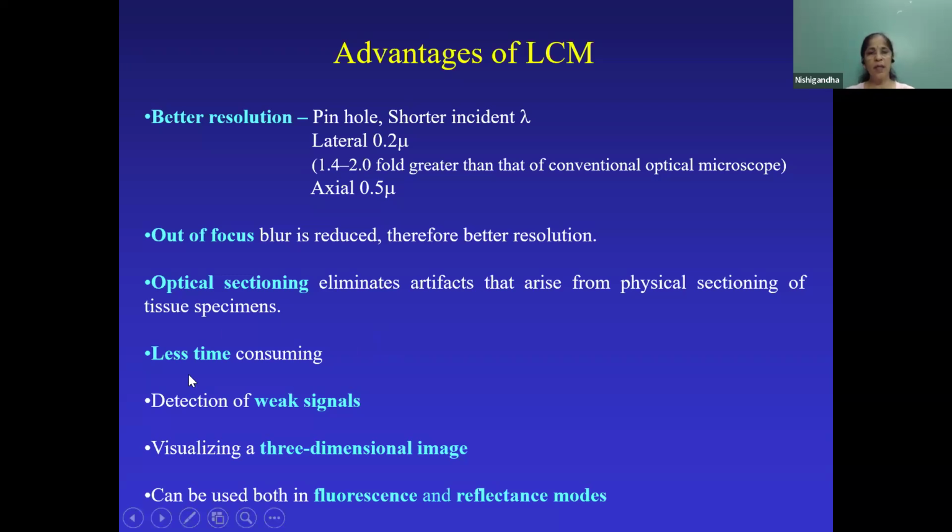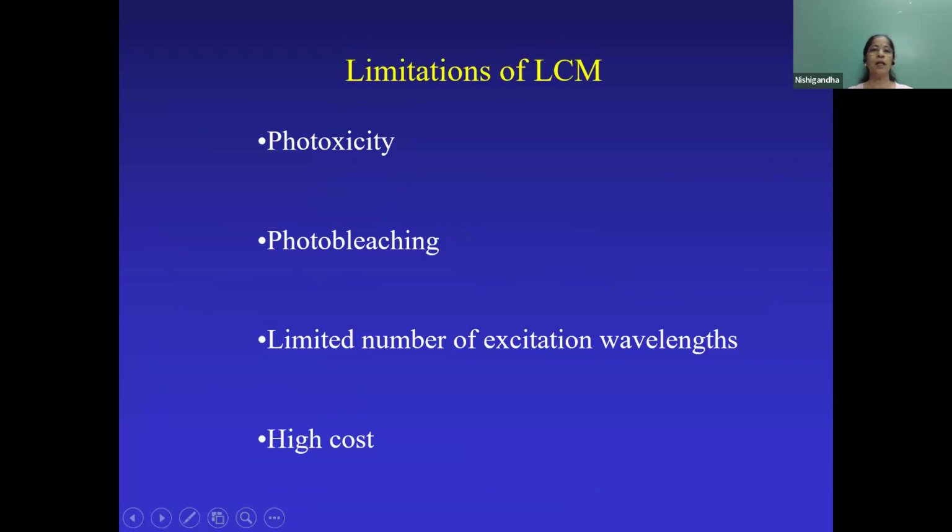Since we are doing optical sectioning, we can go deep inside and even weak signals could be detected. And visualizing a three-dimensional image is the most important advantage. And this can be used, as I said, in two modes, fluorescence mode or reflectance mode.